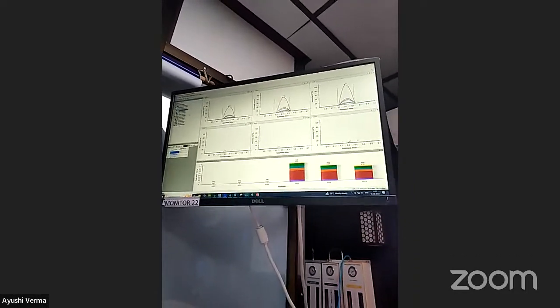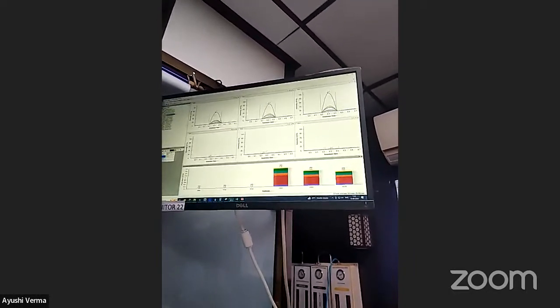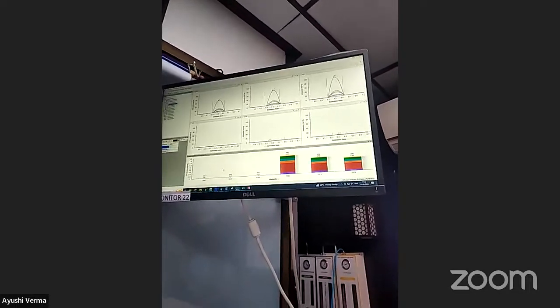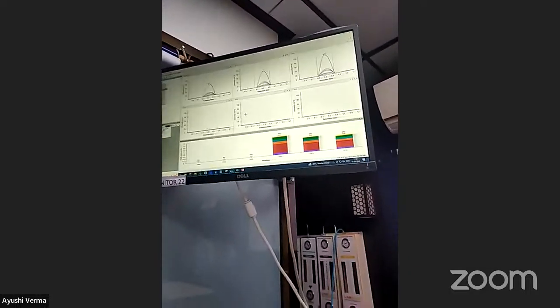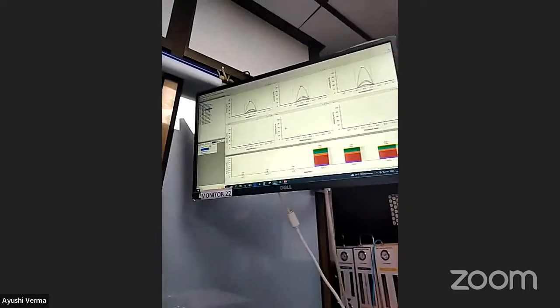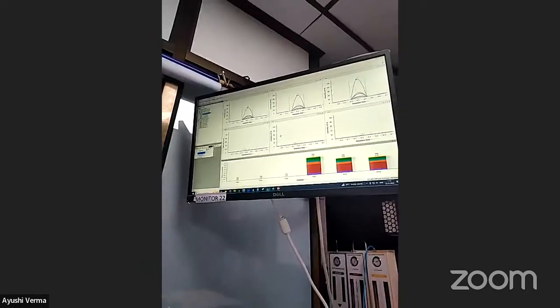We have identified multiple proteins that show differential regulation between the groups, and you can also see the intensity in the negative and positive samples. So this instrument is very good for doing targeted proteomics after analyzing the global proteomics data set. So yeah, over to you.